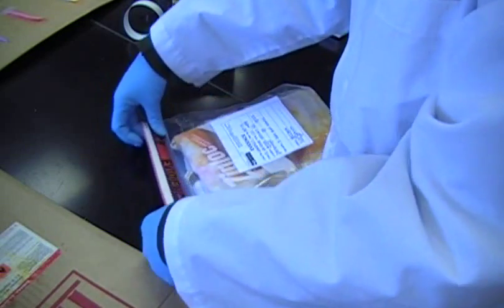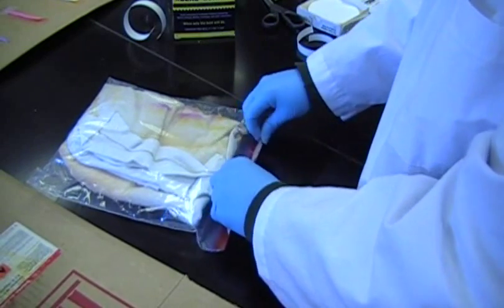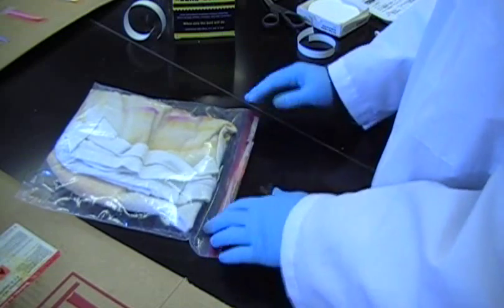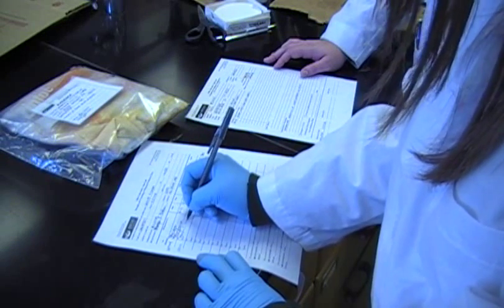Once the analysis is complete, the evidence is repackaged and sealed with evidence tape. This will prevent tampering with the evidence once it leaves the laboratory. To complete the chain of custody forms, the evidence is signed back over to the investigating officer along with any results.